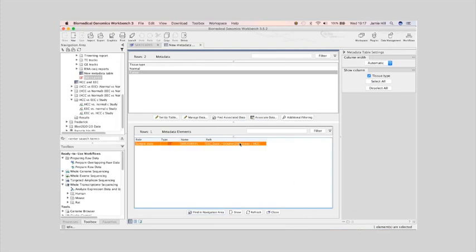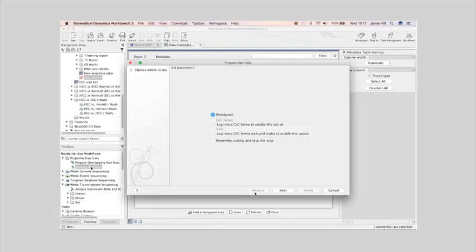And this will become useful later, because once you've got the metadata set up, you'll see that a lot of plots get decorated with the metadata about your samples. And that makes it very easy to do statistical analysis. So with that formality done, I'm going to run this workflow.